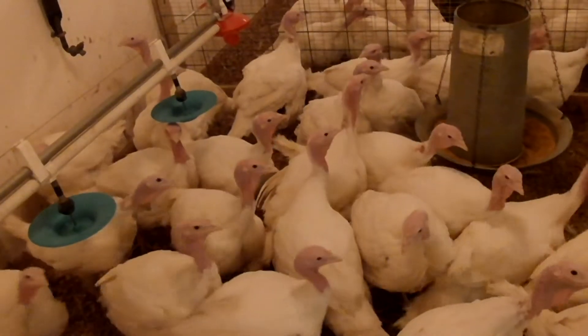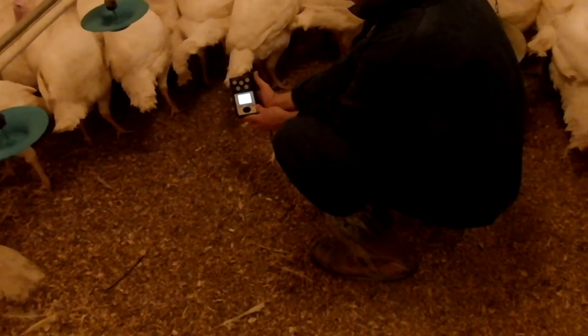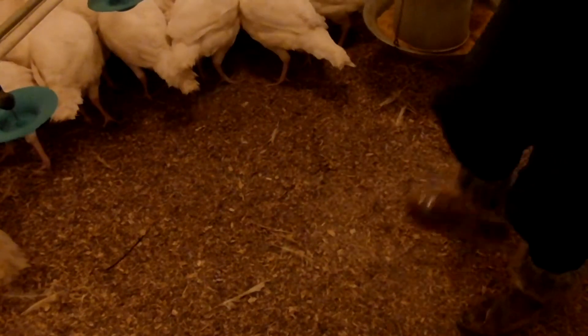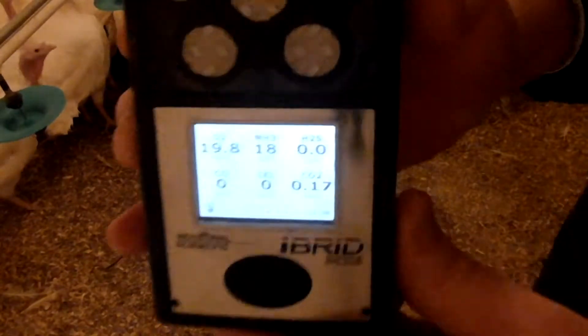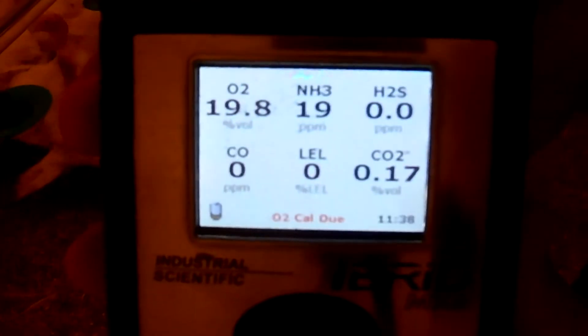The first comparison was made in a turkey pen. The handheld gas monitor was used to measure the ammonia gas concentration in the pen first. The monitor was held at bird breathing level for several minutes to allow the instrument to reach a steady reading. The measured ammonia concentration was between 18 and 19 parts per million.